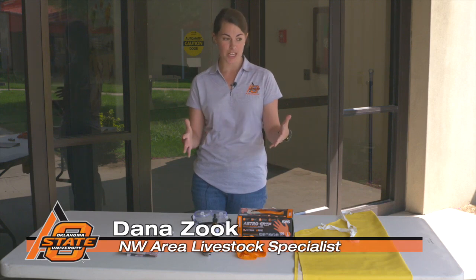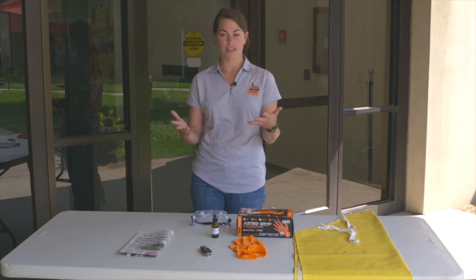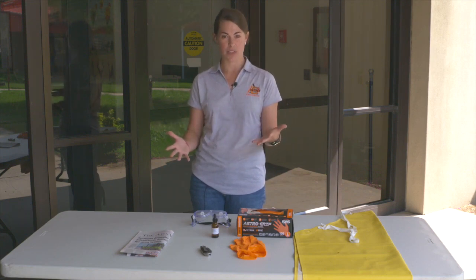Good morning. My name is Dana Zook. I'm an area livestock specialist from Enid, Oklahoma. I cover the Northwest District. This morning I'm going to be talking to you about the tools you need to properly conduct a nitrate test within the office.